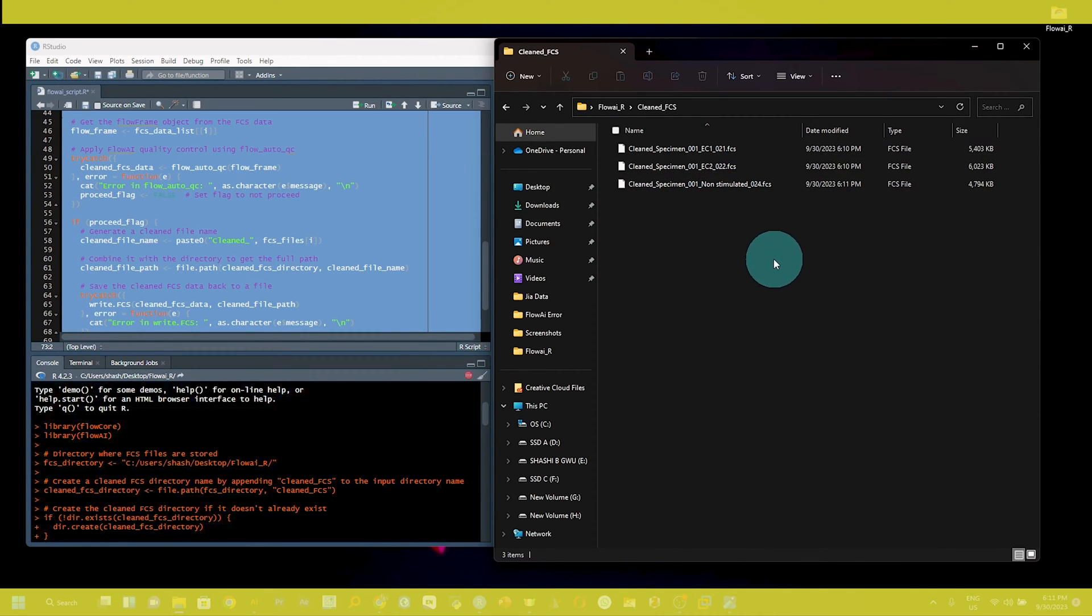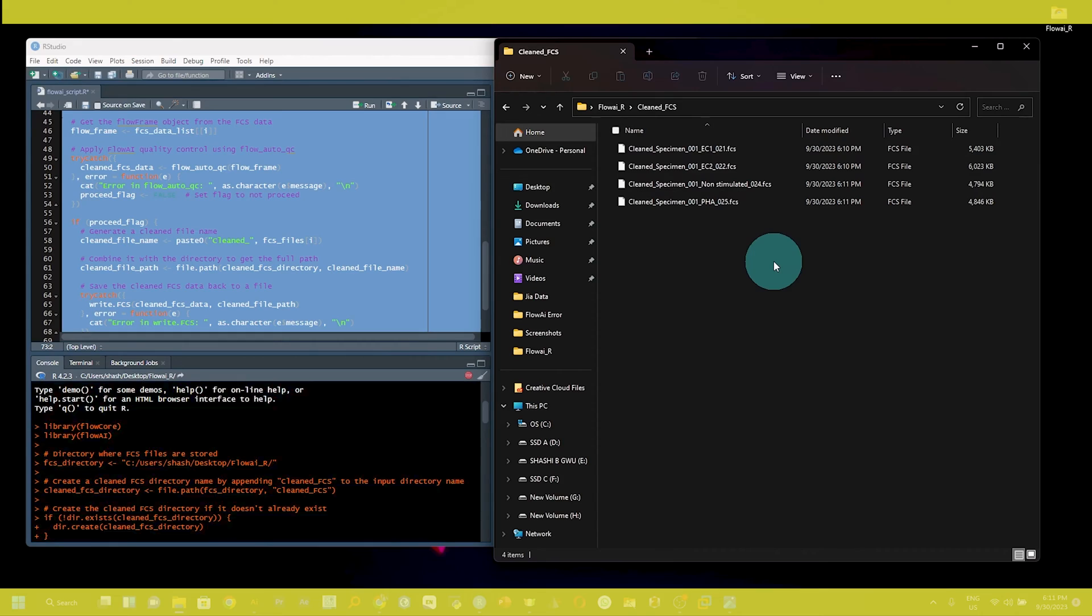We have to wait. This is very important: the speed of processing time is 10 times faster than any incorporated flowai version of this cleaning tool.